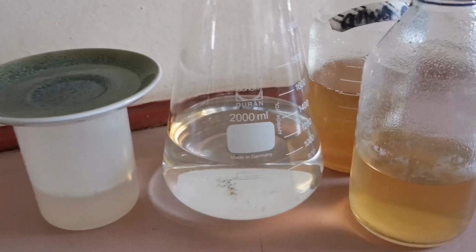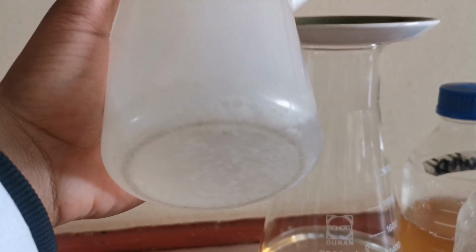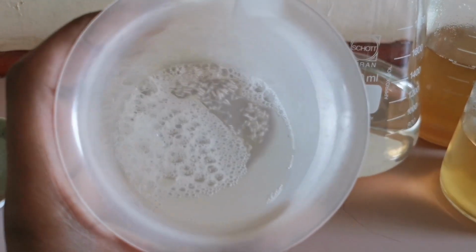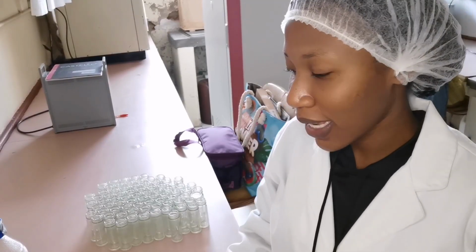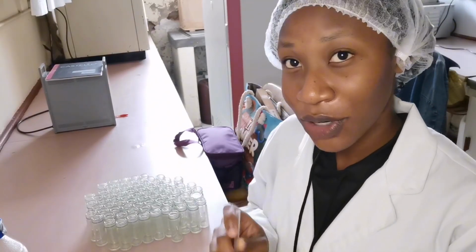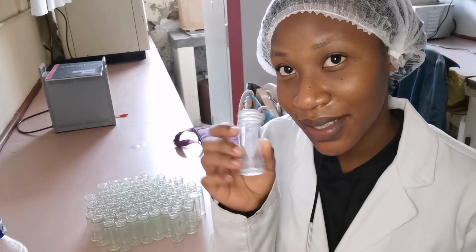And the Ekoprim still hasn't fully dissolved, guys. Okay, so now since my Ringer solution has fully dissolved, I'm going to be measuring 9 milliliters of the Ringer solution and placing it into these small vials you see over here.